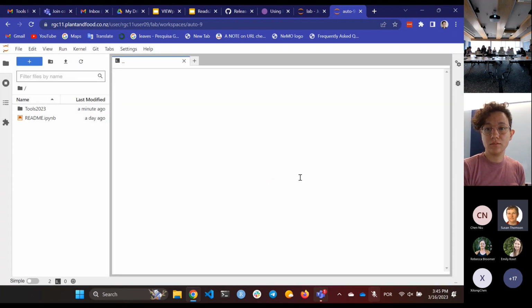And now you want to get those files, so just copy and paste all of those things into that. I won't worry about it.